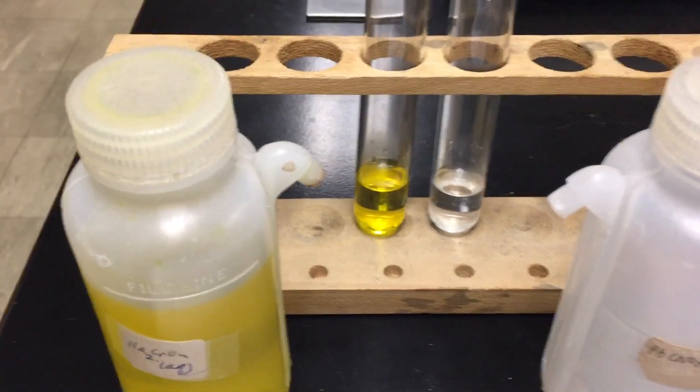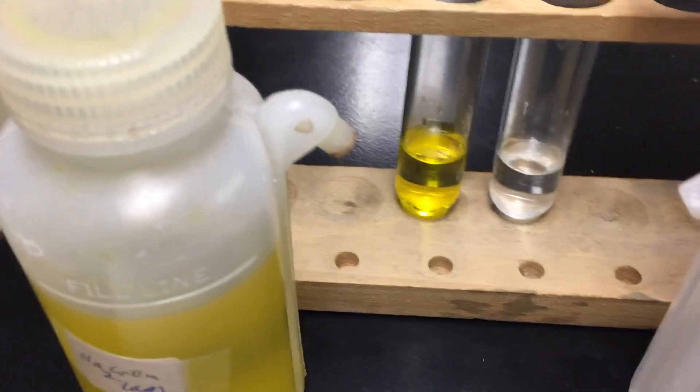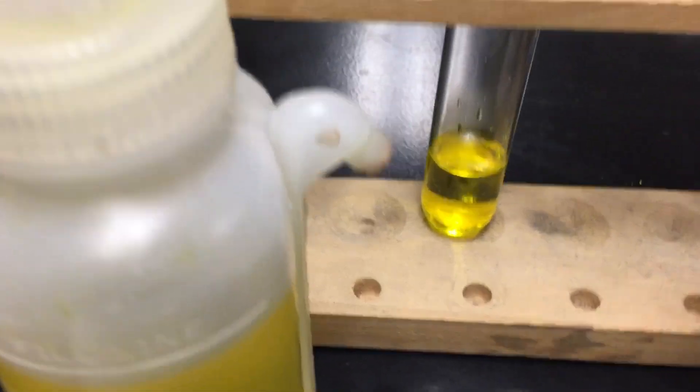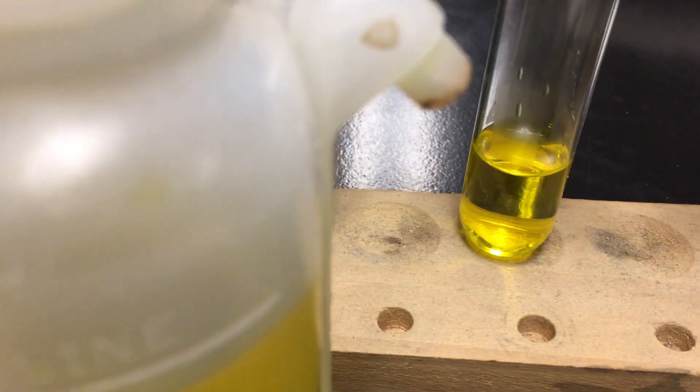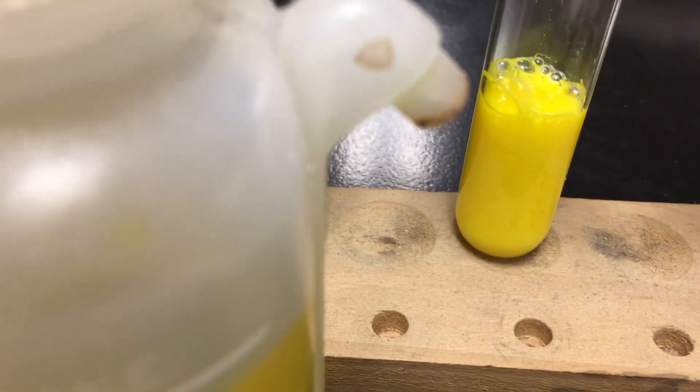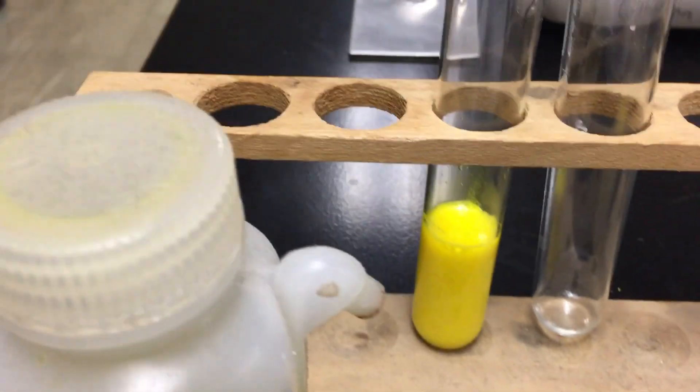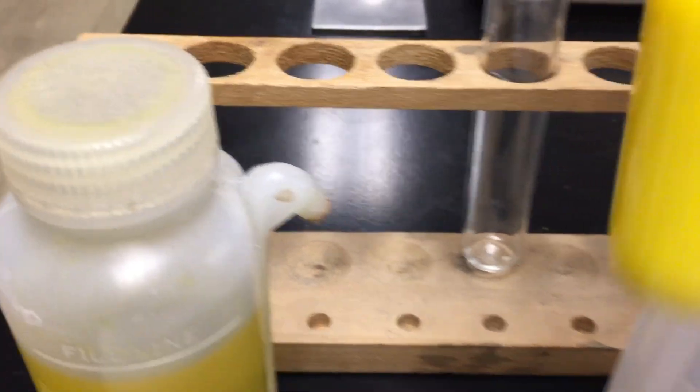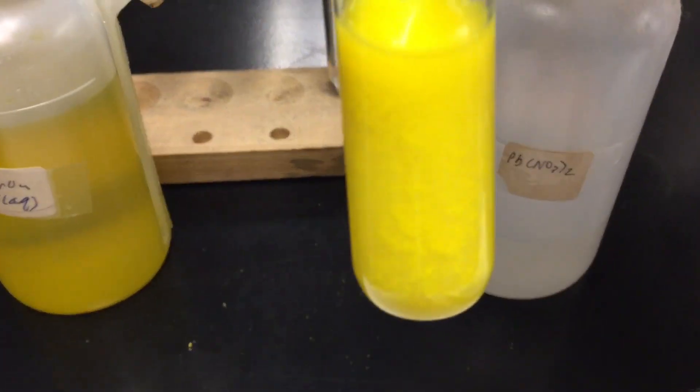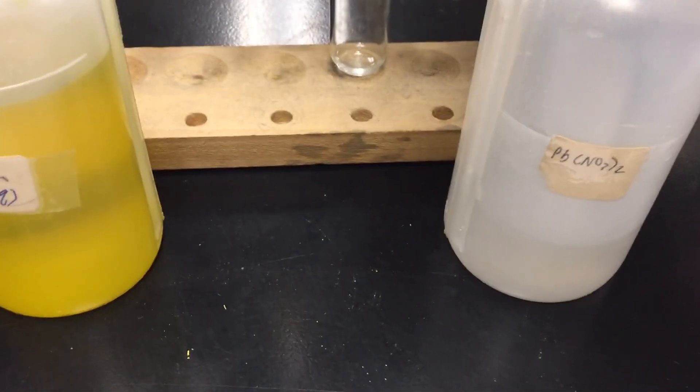So the type of reactants you're dealing with often determine the rate of the reaction. So let me add the lead 2 nitrate to the sodium chromate, and we'll see how quickly that reaction proceeds. And you can see that the yellow precipitate forms instantaneously. So nature of reactants is a factor that affects the rate of a reaction. You can see the yellow precipitate there, and that will eventually settle out.